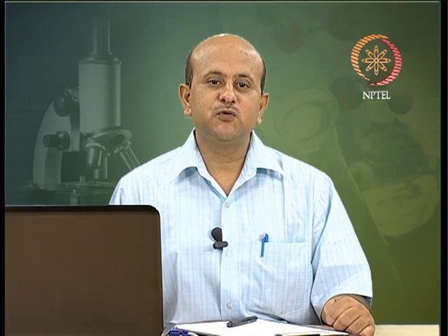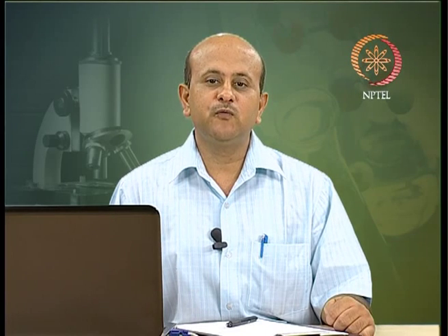The usual light source in these instruments is a high pressure short arc xenon lamp, and ordinary xenon arc lamps are unsuitable for use in the low UV region. So light from synchrotron sources, which has a much higher flux at short wavelengths, has been used to record CD down to 160 nanometers. Recently, the CD spectrometer at the electron storage ring facility ISA at the University of Aarhus in Denmark was used to record solid state CD spectra down to 120 nanometers.